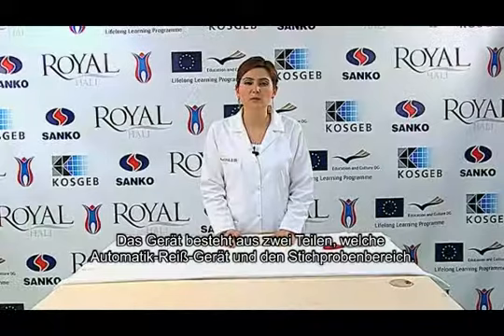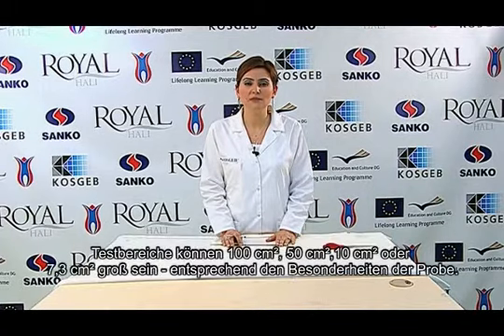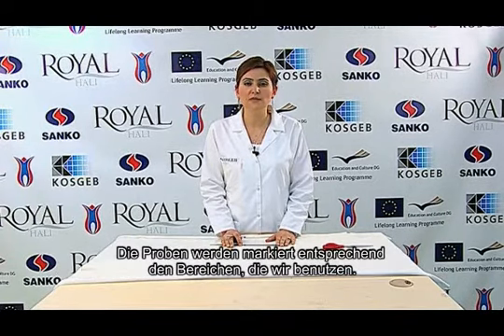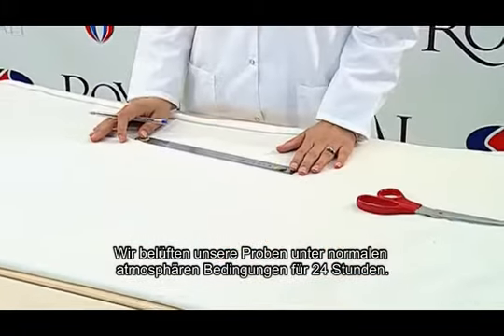The device is comprised of two parts, which are the automatic bursting device and the sample test area. Test areas can be 100 square centimeters, 50 square centimeters, 10 square centimeters, or 7.3 square centimeters, according to the characteristics of the sample. The test sample is marked according to the area we will use. We condition the test sample under standard atmospheric conditions for 24 hours.